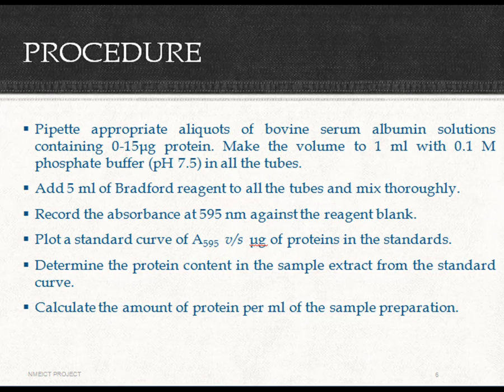Record the absorbance at 595 nanometer against the reagent blank. Plot a standard curve of absorbance at 595 versus microgram of the protein. Determine the protein content in the sample extract from the standard curve. Calculate the amount of protein per ml of the sample. Okay, this is a brief overview of the procedure.